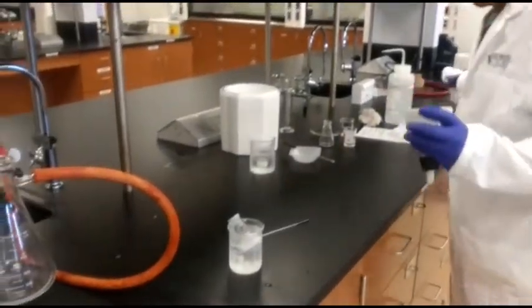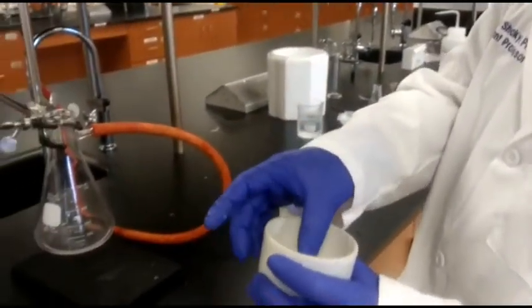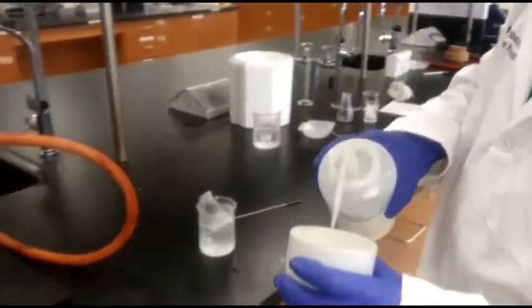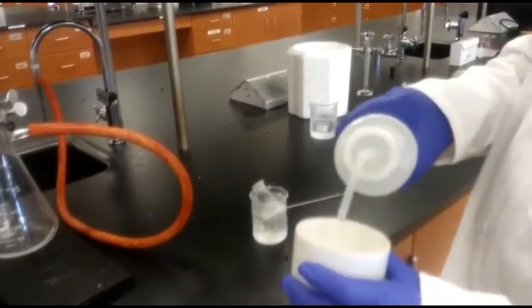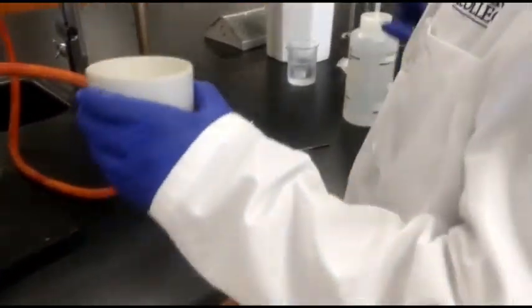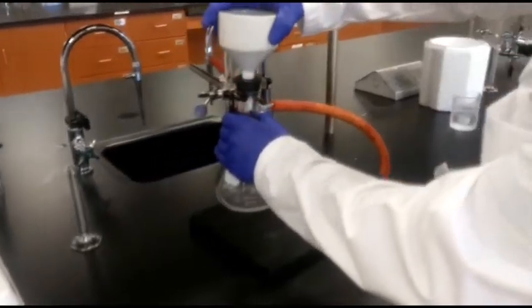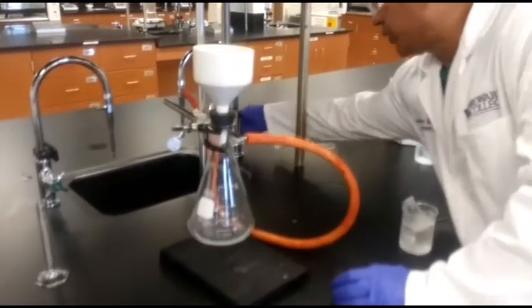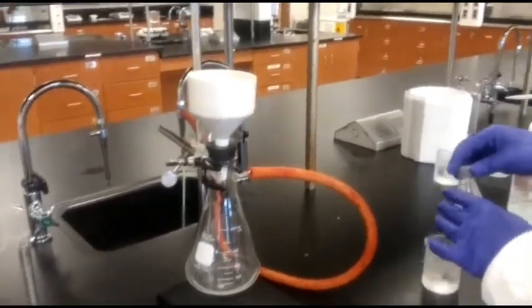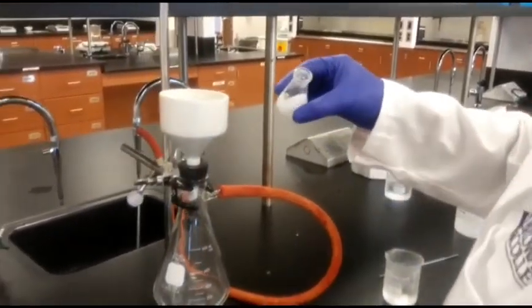I use this small filter paper as before, so that needs to be set properly in the Buchner funnel, and here. So again, it's already set up here, so I can add the water, and this product needs to be poured here.